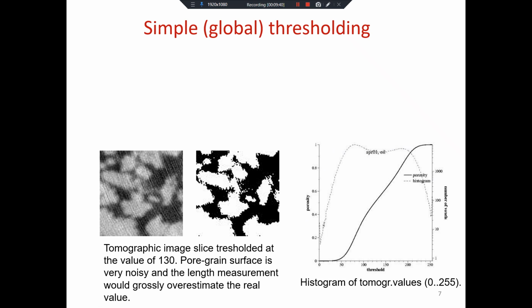Okay? So you can maybe spend time filtering the image a little better, or using an advanced segmentation method, which technically has some of these filters built in. Right? So in that sense, simple thresholding most often doesn't work well unless you have a very clean image.